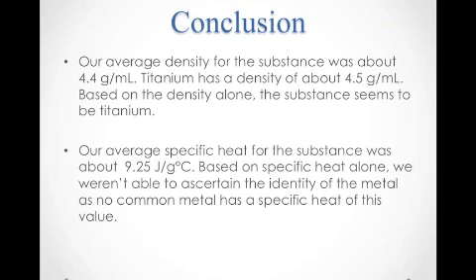So in conclusion, the identity of our mystery metal seems to be titanium, because we calculated a density of 4.4 grams per milliliter, and titanium has a density of about 4.5 grams per milliliter. And unfortunately, we couldn't use our specific heat capacity to identify our metal because it was 9.25 joules per gram degrees Celsius, which no common metal has and is actually much, much higher than the specific heat of most metals.